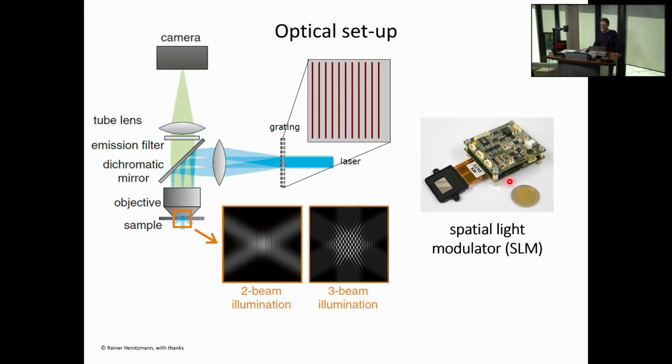There are electronic devices you can use, so-called spatial light modulators, and these are essentially just addressable pixels. You illuminate these devices, and each pixel can be made bright or dark, and that allows you to image the patterns directly onto the sample. And you know, the way that this data projector works, that you know from lectures, it uses devices similar to this to allow you to put information in pixelated form onto a screen.